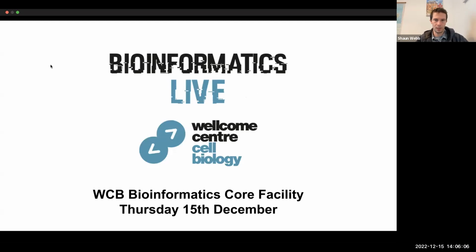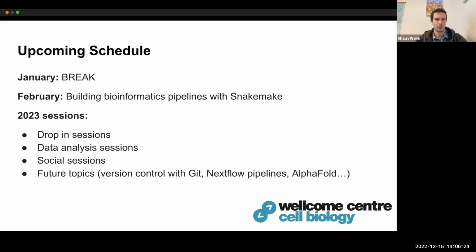So welcome to another Bioinformatics live session. Today is a relatively easy one, just to sort of ease us into the Christmas break, and it's just about downloading sequencing data, and primarily from the Sequence Read Archive, the SRA.